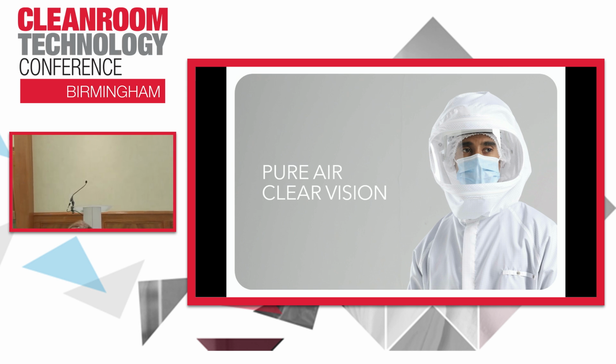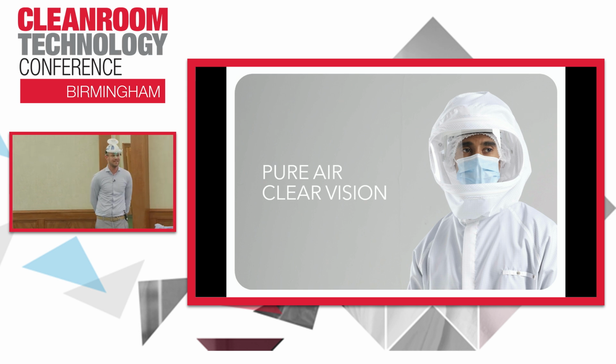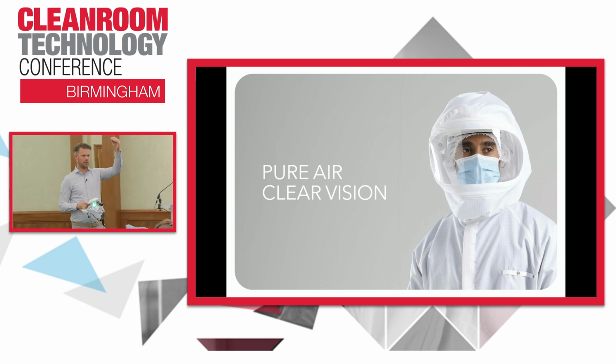Is there a filter on the top, or have you considered putting a filter on the top? I will just, at the air intake, as I can enter here properly. Sorry, say again. Is there a filter on the top, or would you consider a filter on the top? I know it's cleanroom air, but as a chemical engineer, I know there are risks. Yeah, but there's not a filter on top of it because it has a lock inside, so it's only the pure filtered air which is coming constantly from outside to the inside. And it's not a PPE, so we don't have a filter on top of it yet. Maybe that's our phase 2, something in the future.